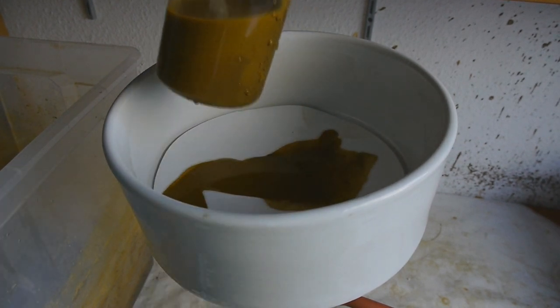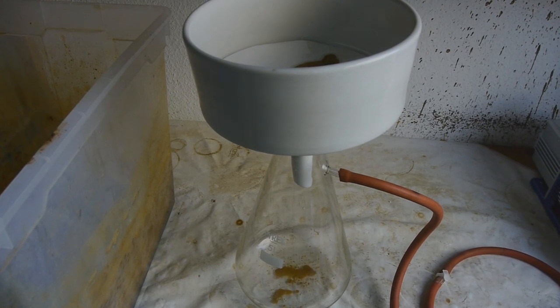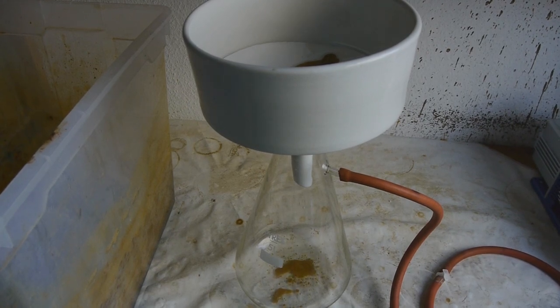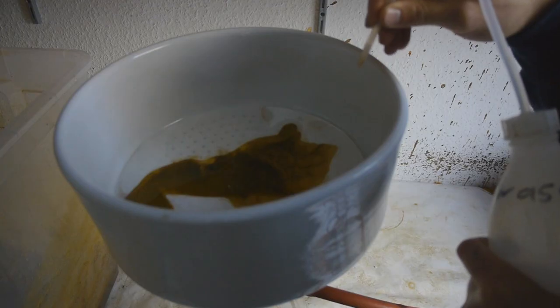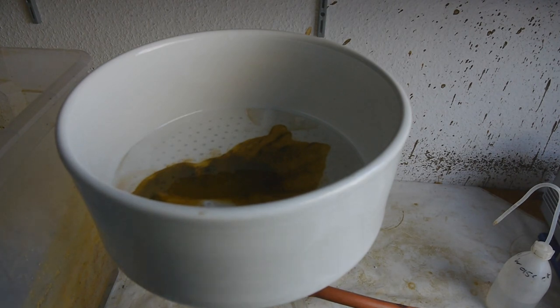I probably should... Yeah, that was... As you can see, this worked amazingly well. Probably should have started the vacuum first and made the entire paper wet. Start the vacuum.